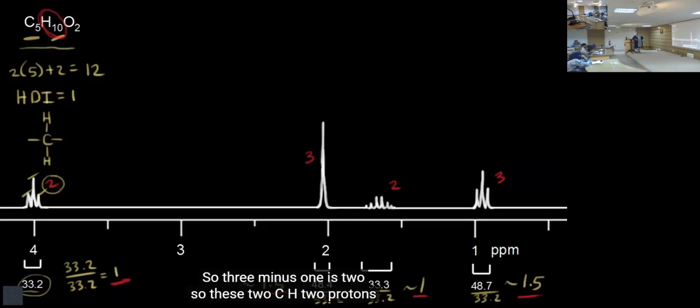So what does this mean? We are talking about the proton resonating at 4 ppm. It's 2 protons and it's a triplet. So 2 protons means it's a CH2. But triplet, neighboring also has 2 neighbors. Exactly.